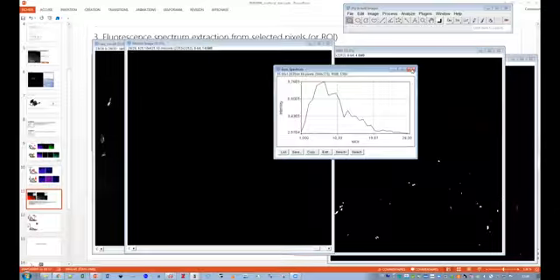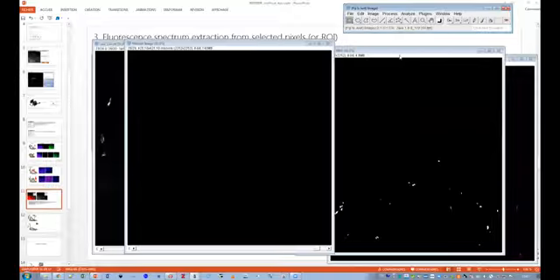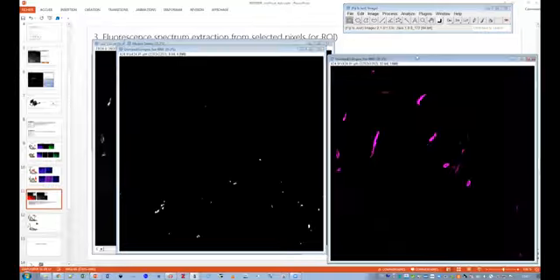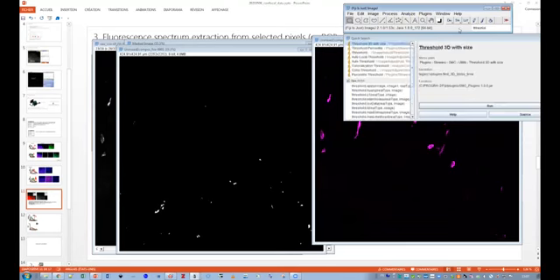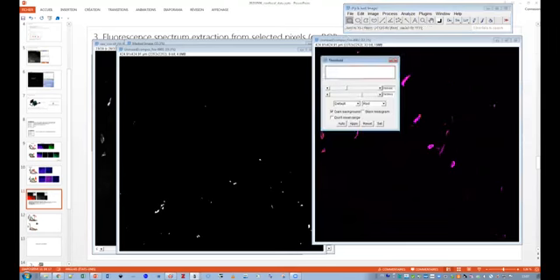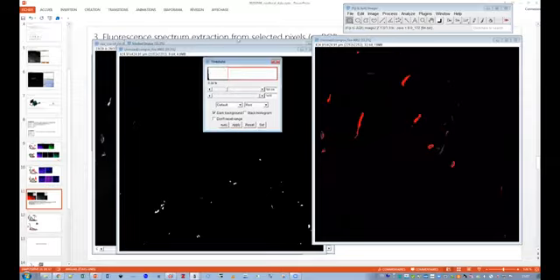Okay, I would like to show you with the second compound, because here you see that it's going to be easier, because obviously we have a chlorophyll signal. So with automatic mode, it is working.